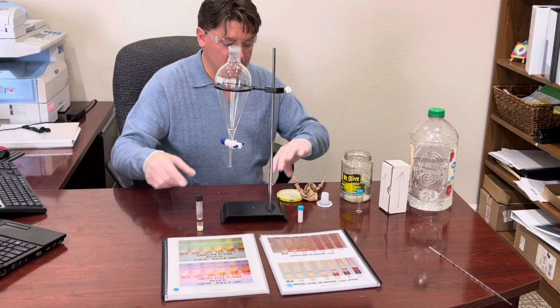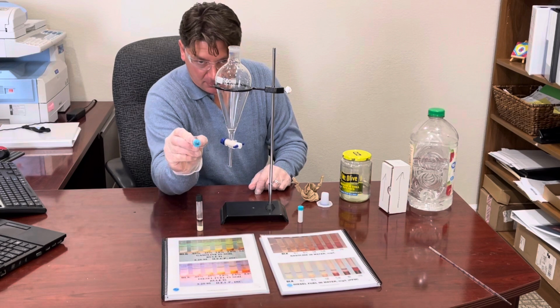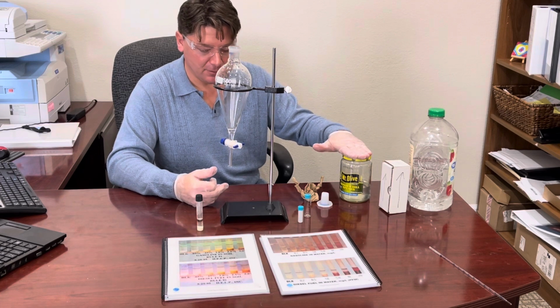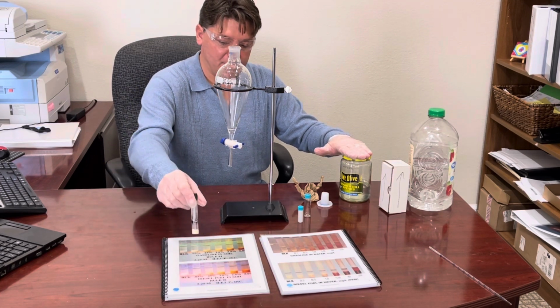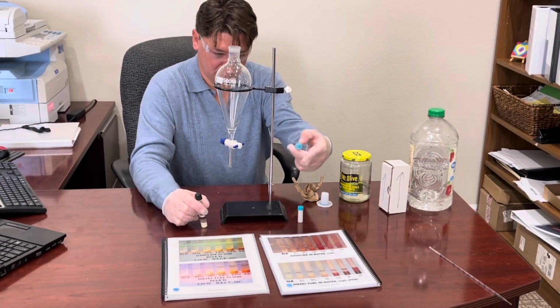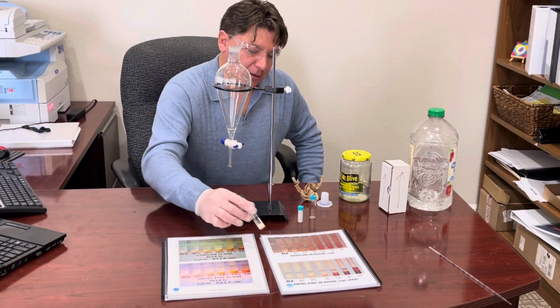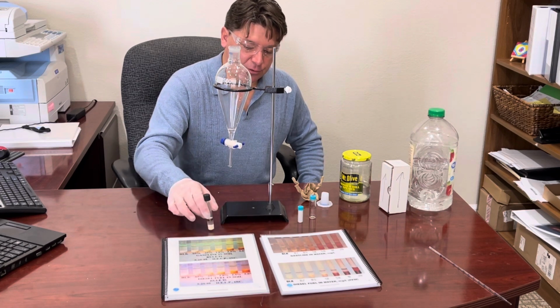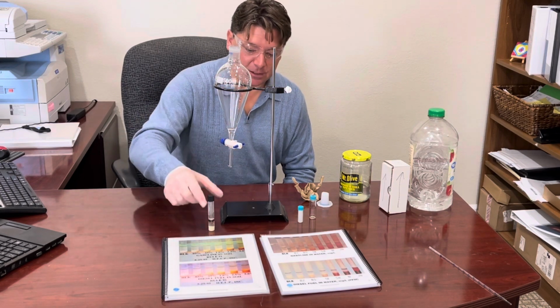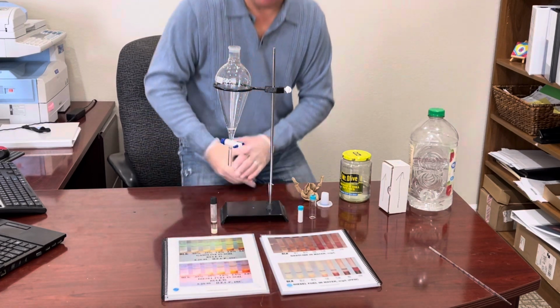So all we were doing here was demonstrating the fact that we can do that by using our high-range extract solvent to do a water, it requires that extra step of getting rid of the water sample. And then of course we're going to have to compare it to our high-range soil calibration book, which is based on using the high-range solvent, as opposed to comparing to our water calibration book, because the water calibration book uses a different solvent. It's much more sensitive, more powerful solvent, and since that's not what we're using to do our extraction, we have to use the other comparison. So there we go. We have it.